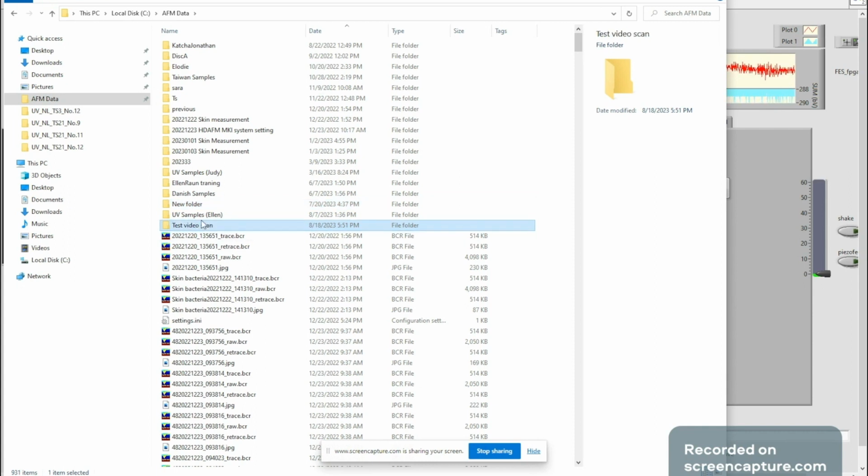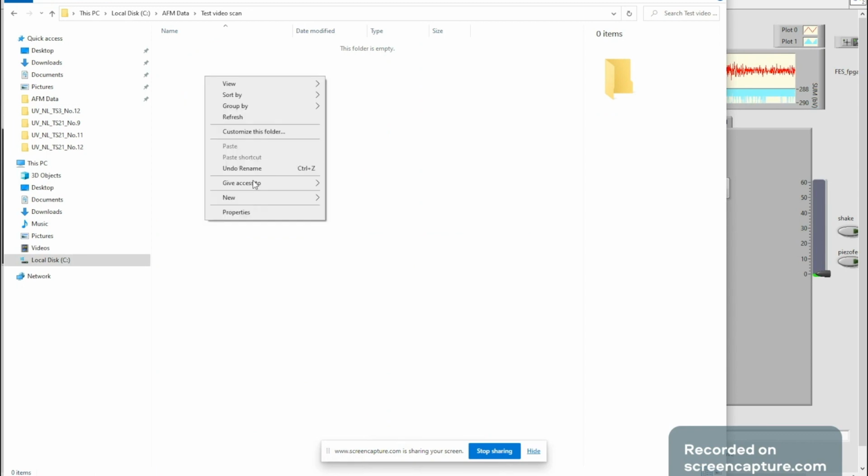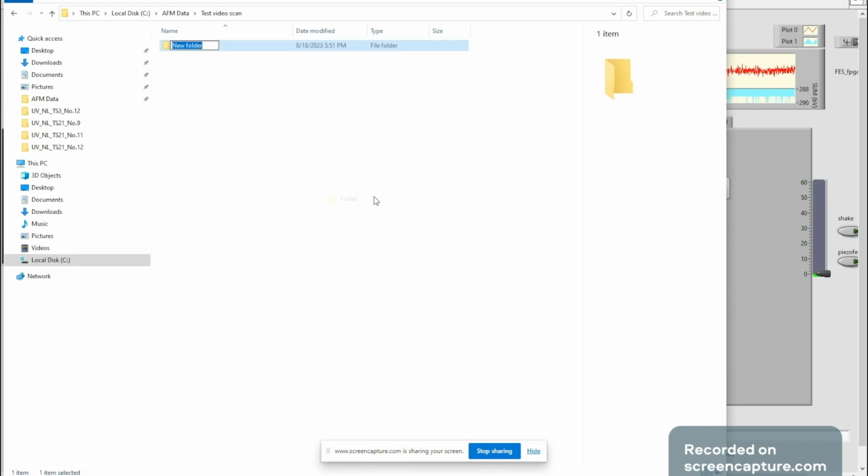Inside the folder we will have our precise sample ID as I showed before. This one is called test, and it's from a healthy person. In this case it's a TL0 and it was tape number 2, and the ID we name as number instead, and that was number 1. And we copy because we need to use it later.